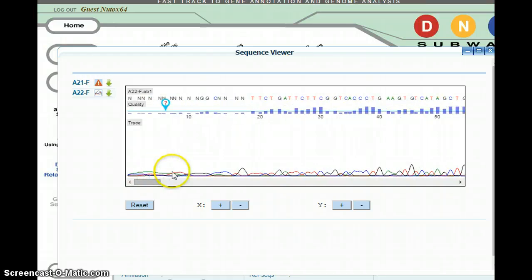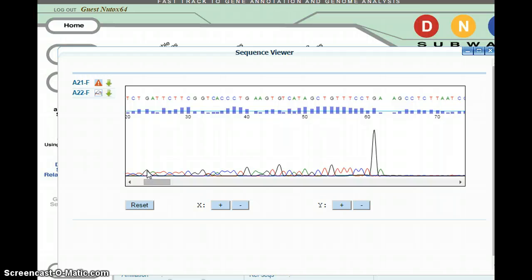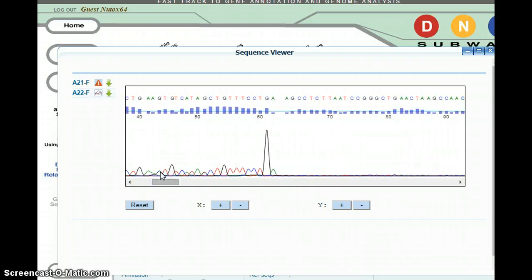Down below, the last thing that the electropherogram points out and shows is what is called the peaks and background noise. All these little peaks that you see at the very bottom of this electropherogram show the quality of your particular DNA sequence. Peaks and background noise is another vocabulary term that you should learn about in the DNA word glossary.